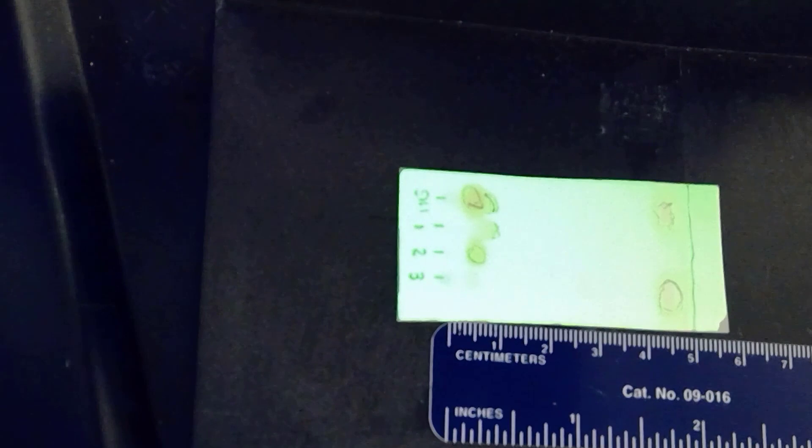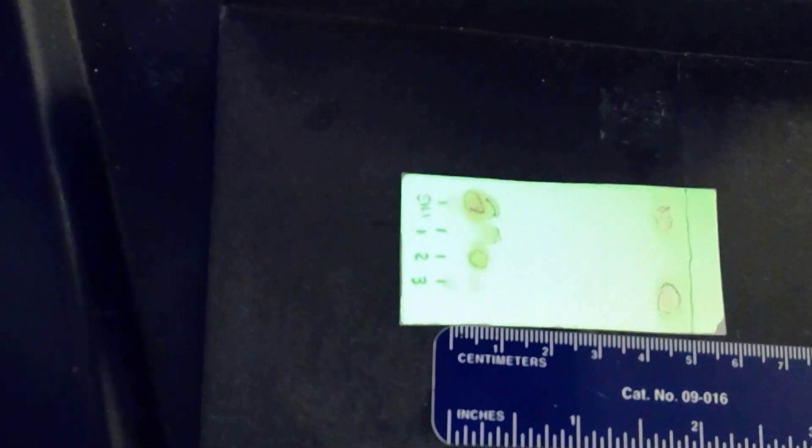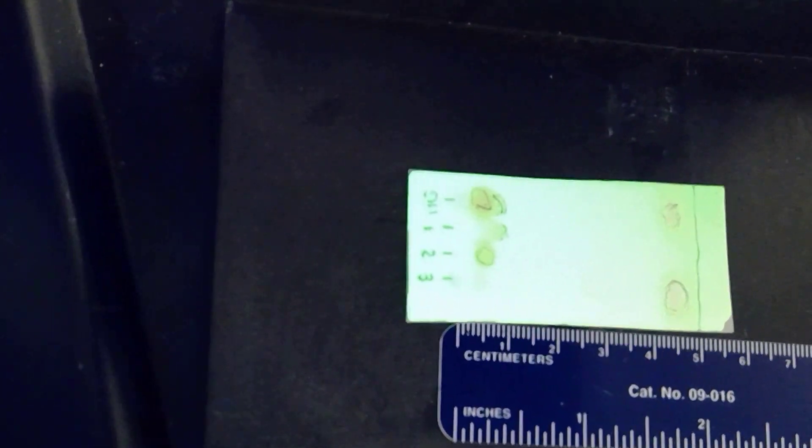The zero of your ruler here is on the origin line, and it looks like our solvent front is about five centimeters up. So please use this to calculate the RF values for all the spots that you see on this TLC plate.